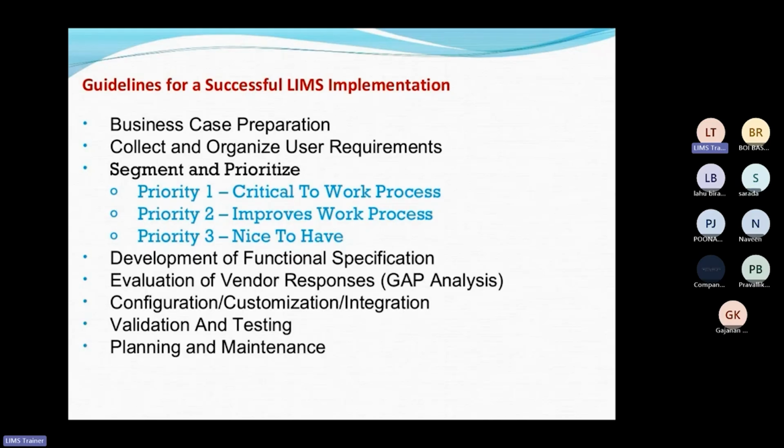Suppose all the instruments in the laboratory are integrated with the software, starting from the weighing balance, and also the logbooks. There are digital logbooks offered by the software, so there are no manual entries in the logbook either. So there is very little chance of missing any logbook entry.